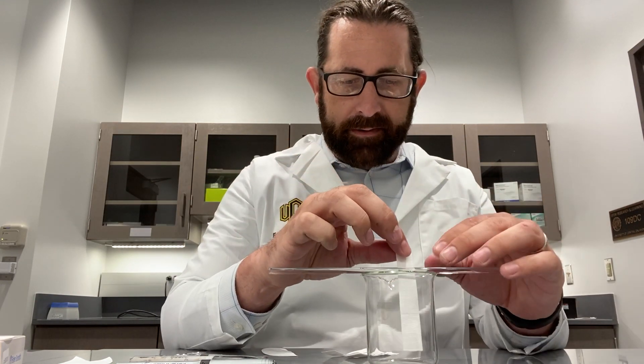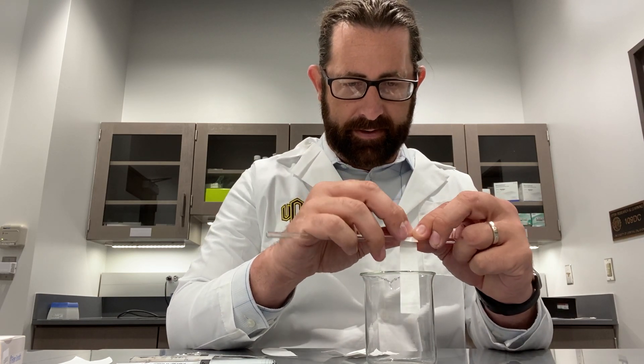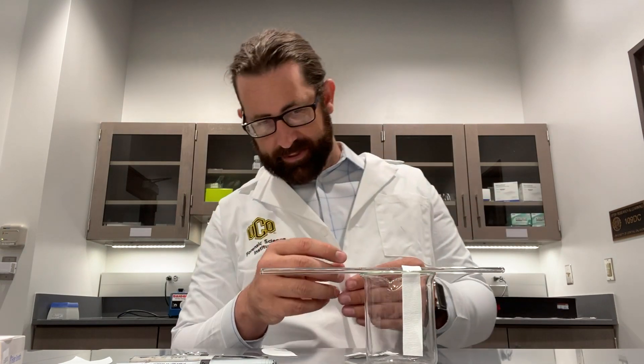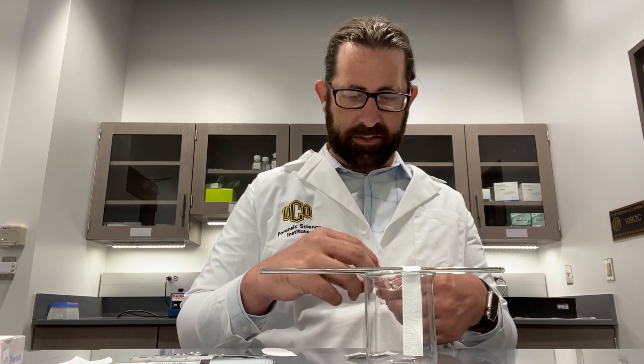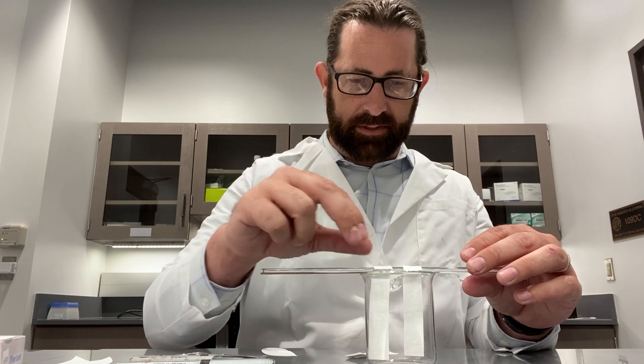I want to have it so this filter paper is just barely touching the bottom. I cut it too short — that's alright. Science works even without perfection. So we're going to do this with two examples here.